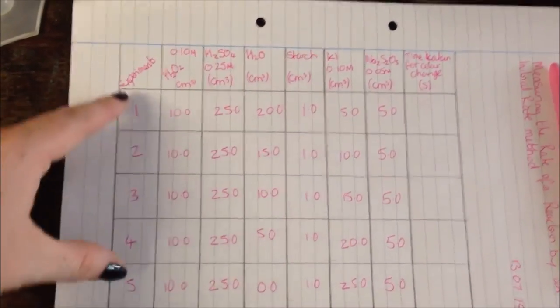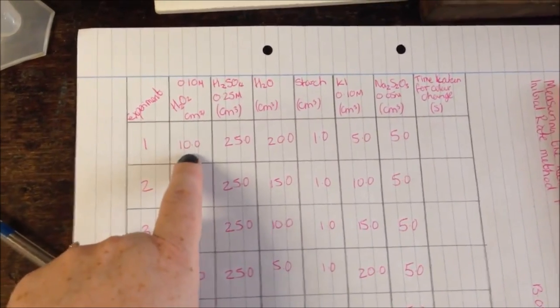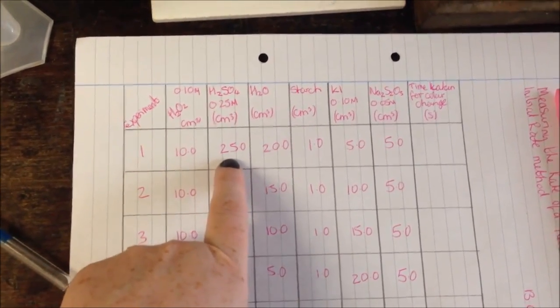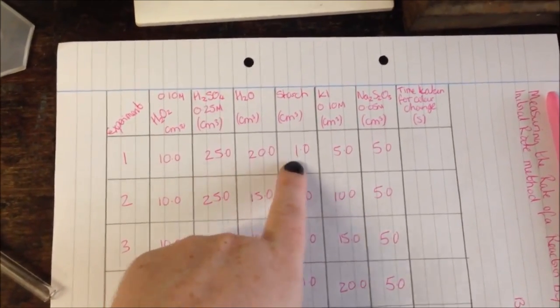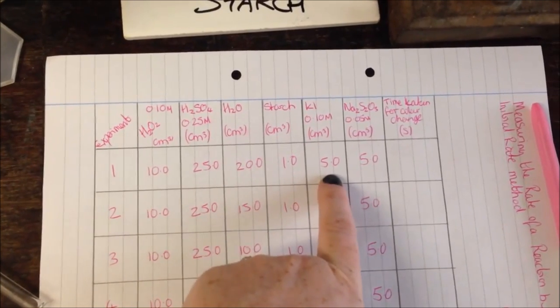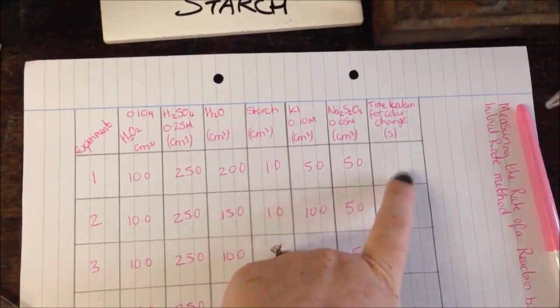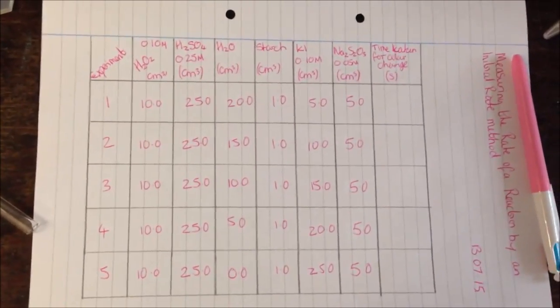The first thing I've done is I've drawn out my table with the experiment numbers and the amounts that I need in the order that I'm going to be using them. First, we're going to have 10cm³ of hydrogen peroxide, 25cm³ of sulfuric acid, 20cm³ of water, 1cm³ of starch, 5cm³ of potassium iodide, 5cm³ of sodium thiosulfate, and then we're going to mix all together and measure the time taken for a colour change.